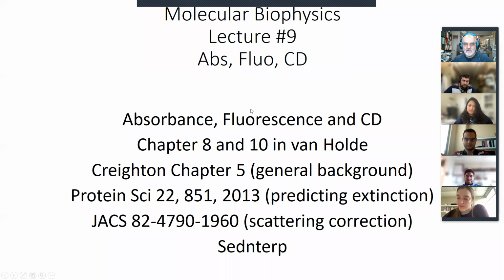Okay. So this again summarizes what I just said, and notice it's general background, and this is telling you we're going to use this to predict the protein extinction coefficients, corrections for light scattering. And when we're doing this, I may open up this software package to show you something about how the software that we use is usable or useful from a sequence, basically, basic information about a protein that we need.